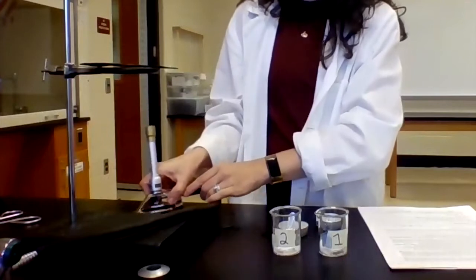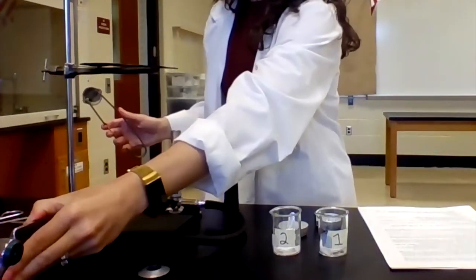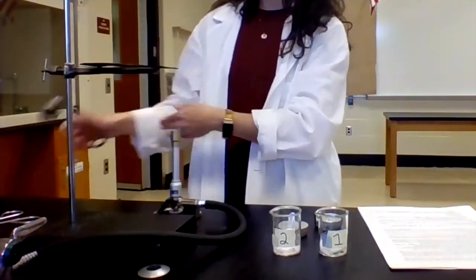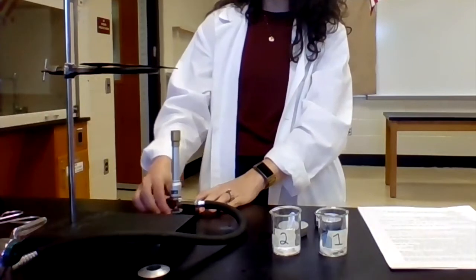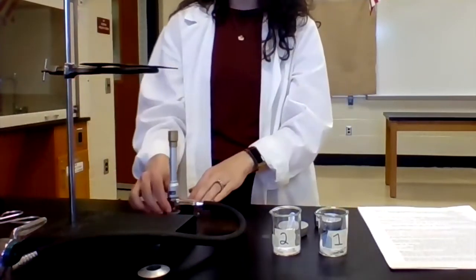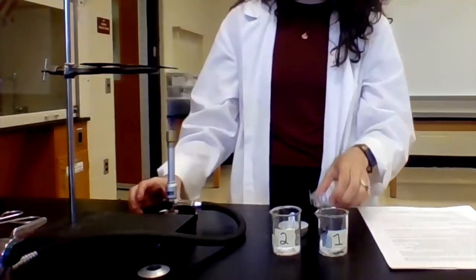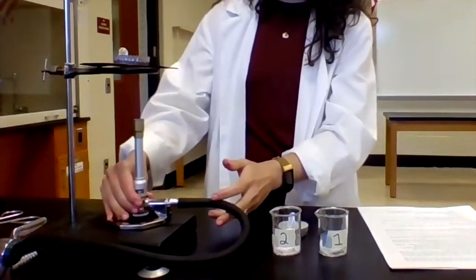So I'm going to light the Bunsen burner. Okay, adjust the height of the flame. I don't want the flame shooting up over the iron ring. And then I'm going to put solid 1 up on the wire gauze.